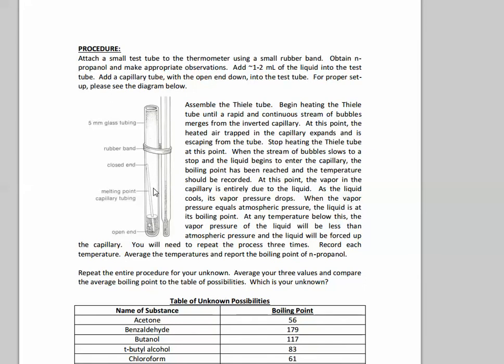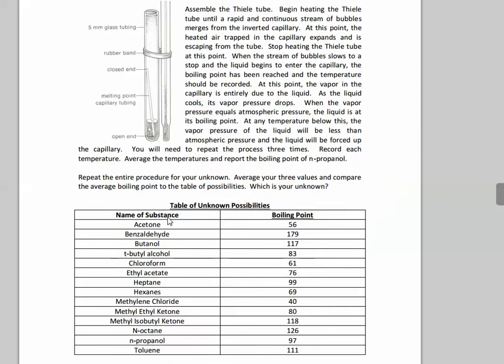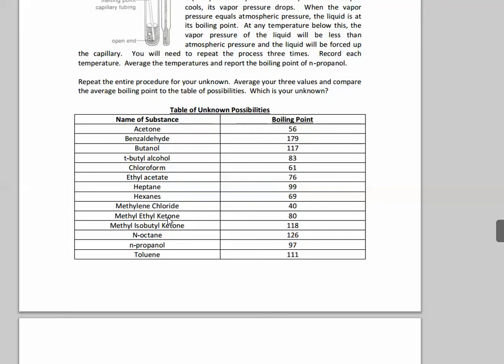The thermometer should actually go inside of there. And then I'm going to slowly heat this contraption up in the Thiele tube. And then here are my list of possibilities.